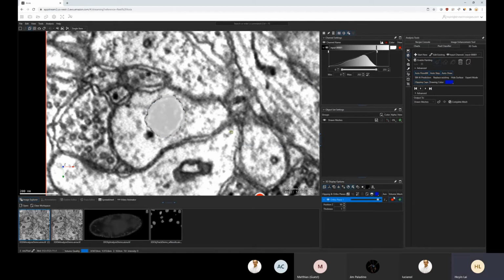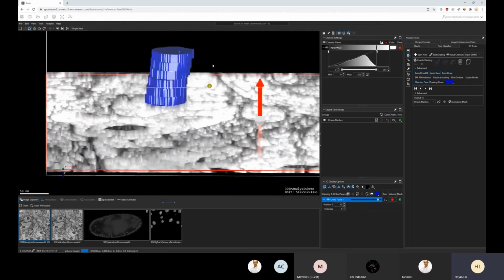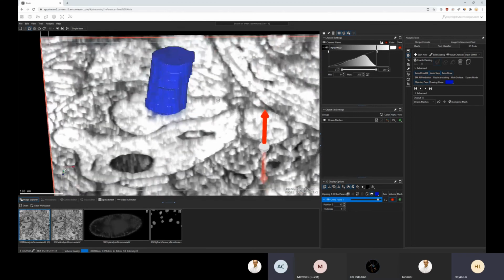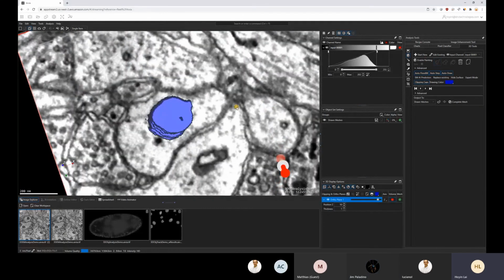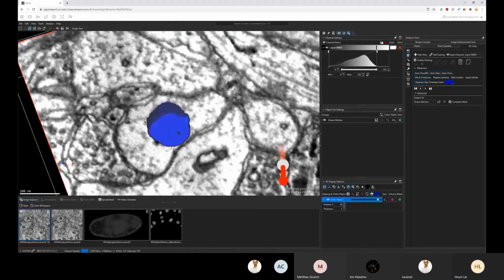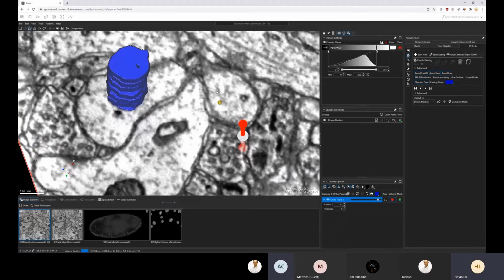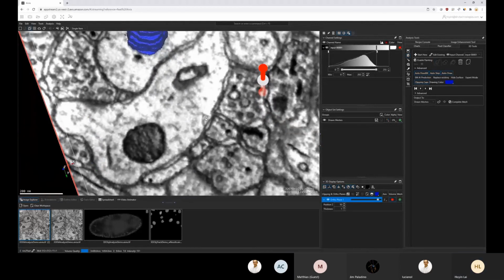And just to give you a view of what it actually looks like, in the 3D display options on the ortho plane, I will turn off the mesh slice so you can see how my slice looks on the result image here. And then I'm going to do another one.